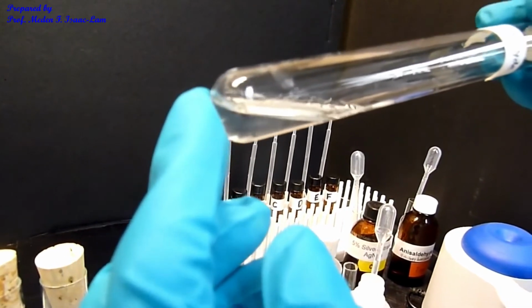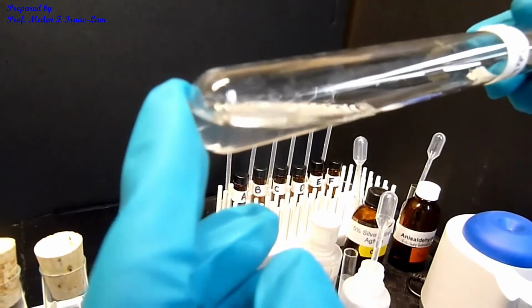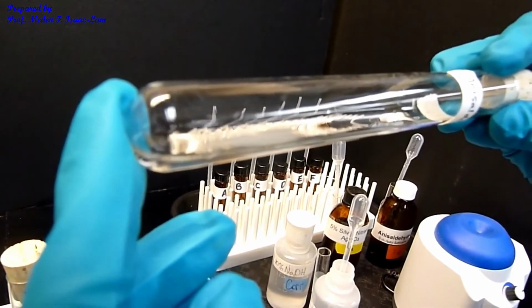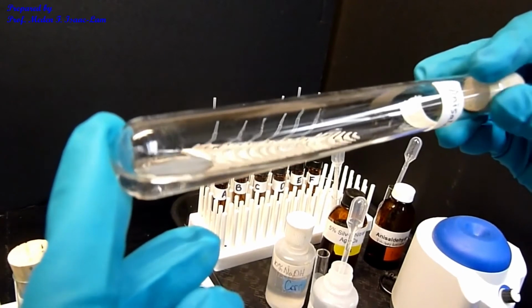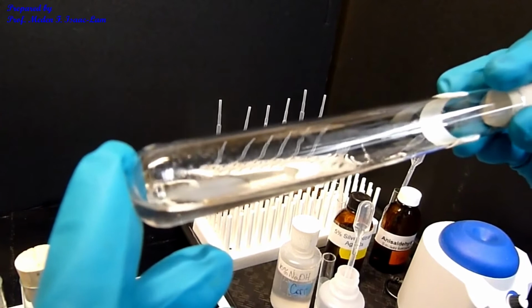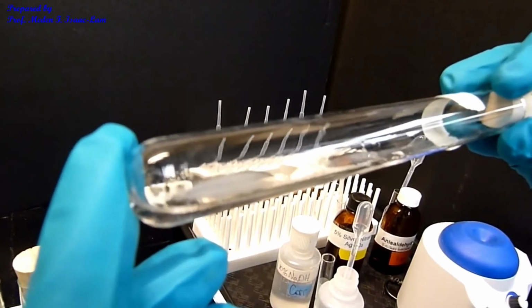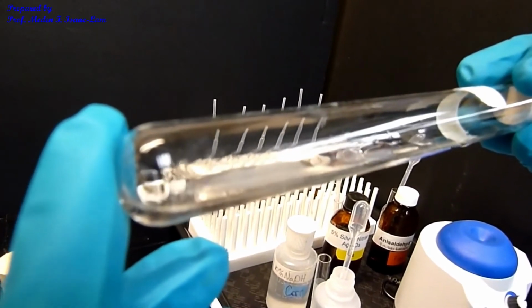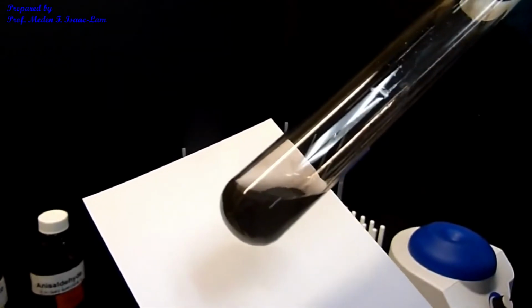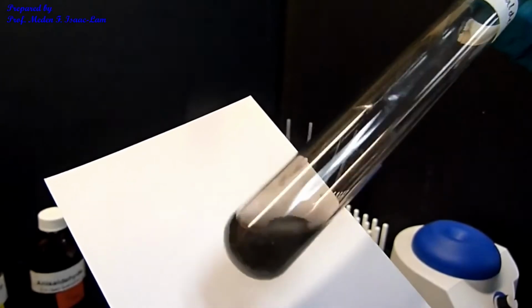So I'm tilting it slightly because I have drops on the side. And I don't want to agitate it. And I'm just really mixing it gently because I want to see the formation of the silver mirror. This is now the standard anisaldehyde with Tollens reagent.